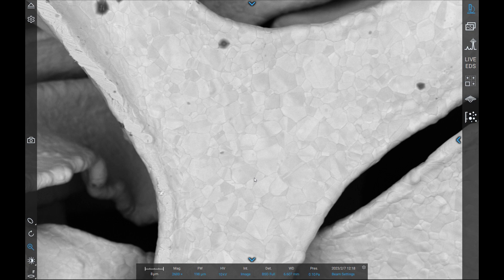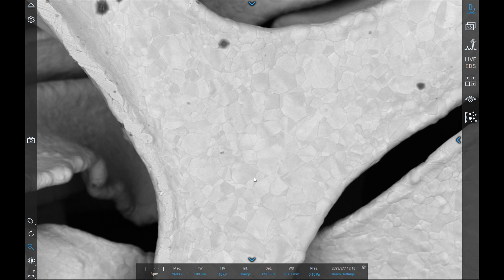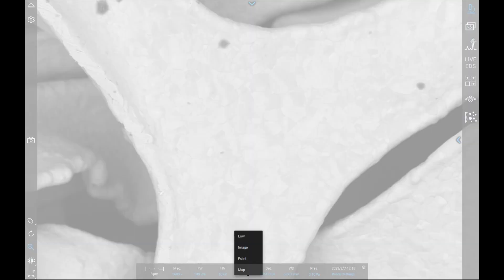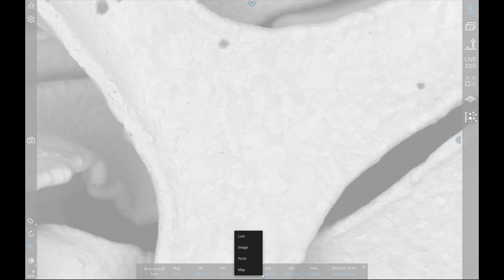Beam intensity determines the number of electrons that are allowed to interact with the sample. This is also referred to as the current of the electron beam. There are four standard settings for beam intensity. These are low, image, point, and map. Each of these settings are labeled for which application they are most optimal for.